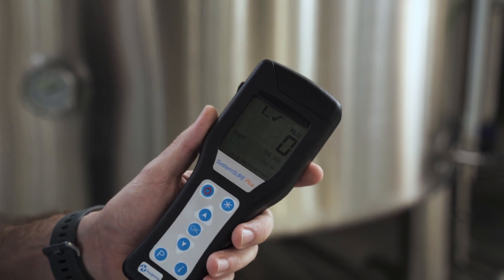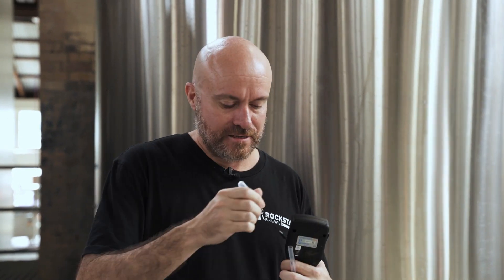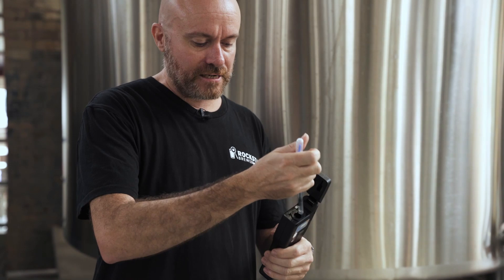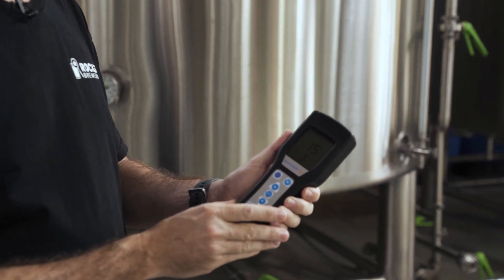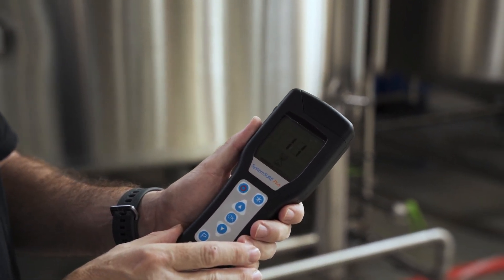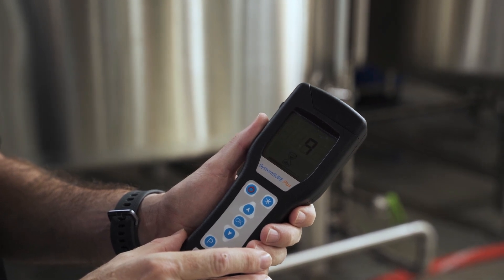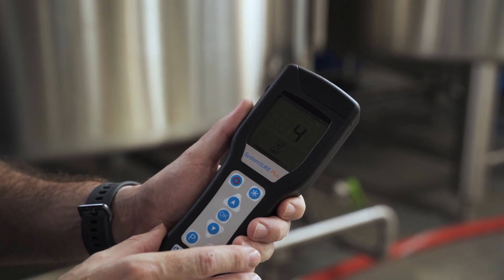And as you can see, we've got a zero count, which means inside the cold liquor tank is absolutely clean. So that's a good result! Now let's check something that might actually be dirty — which is my beard. All I need to do is rub it on my beard like so, back in, give it a bit of a shake, back in the machine, and let's take a look.